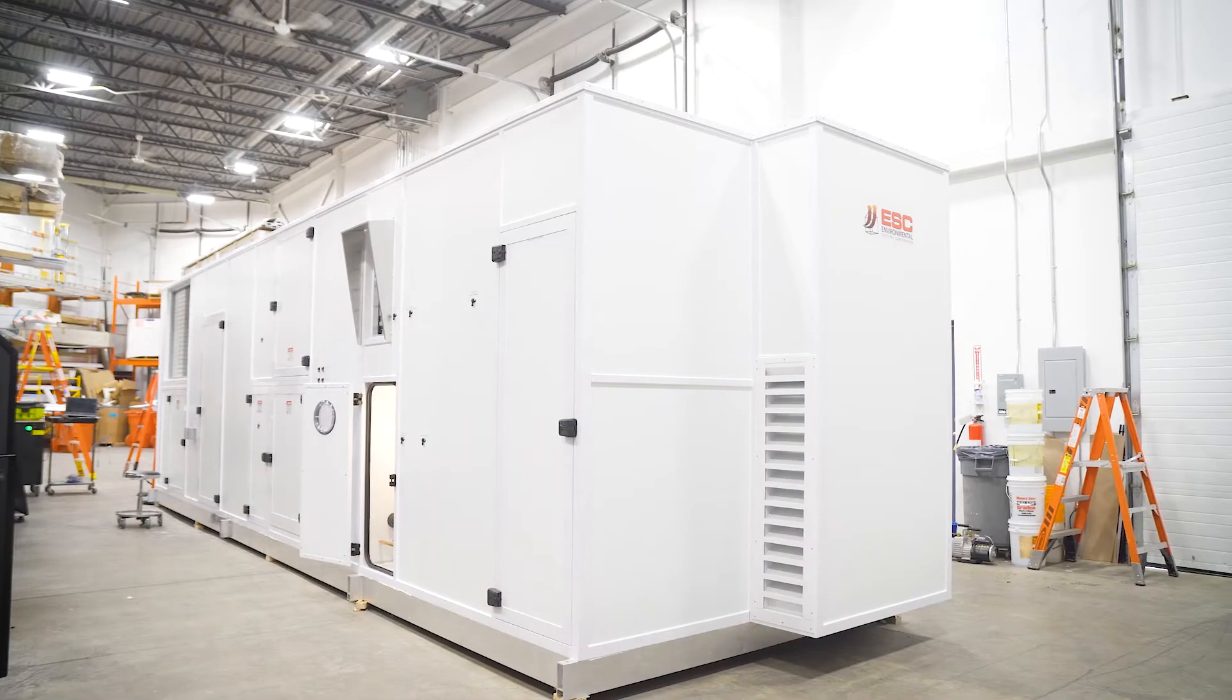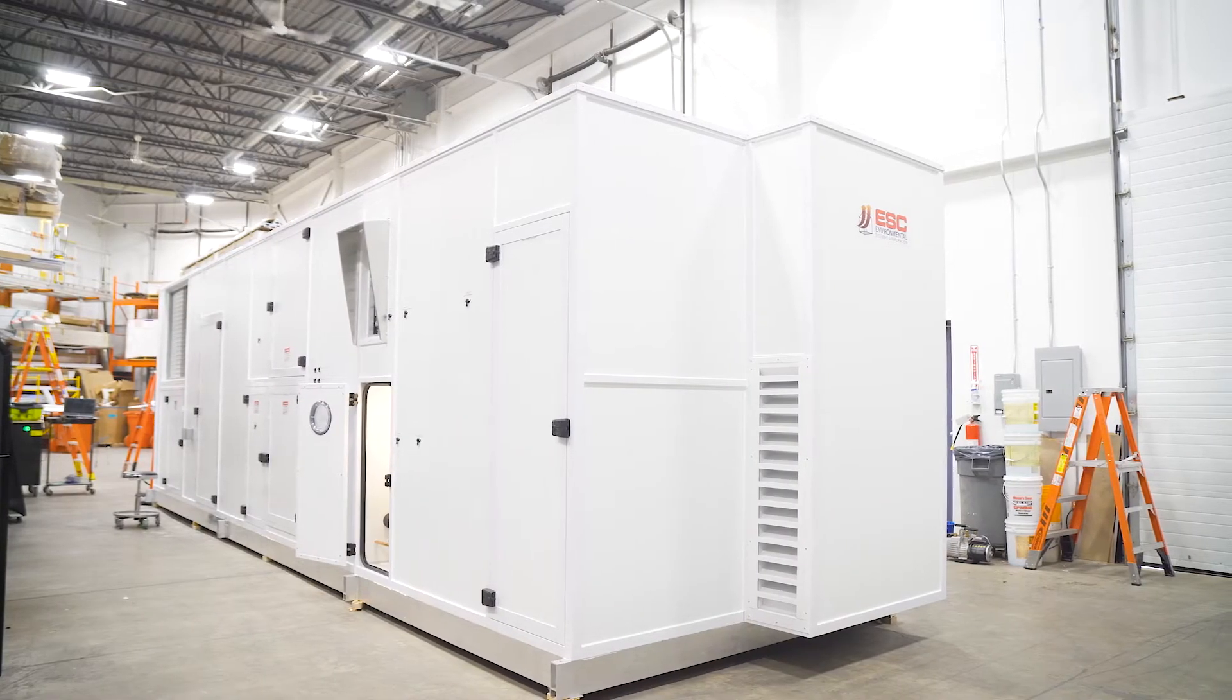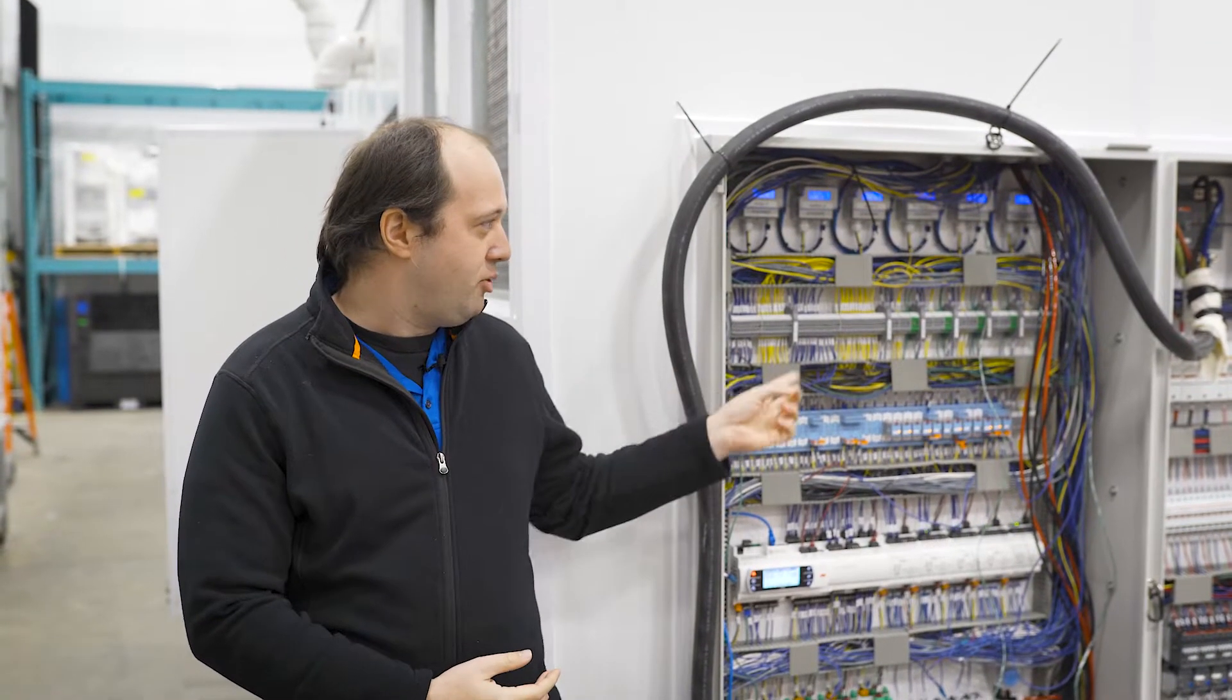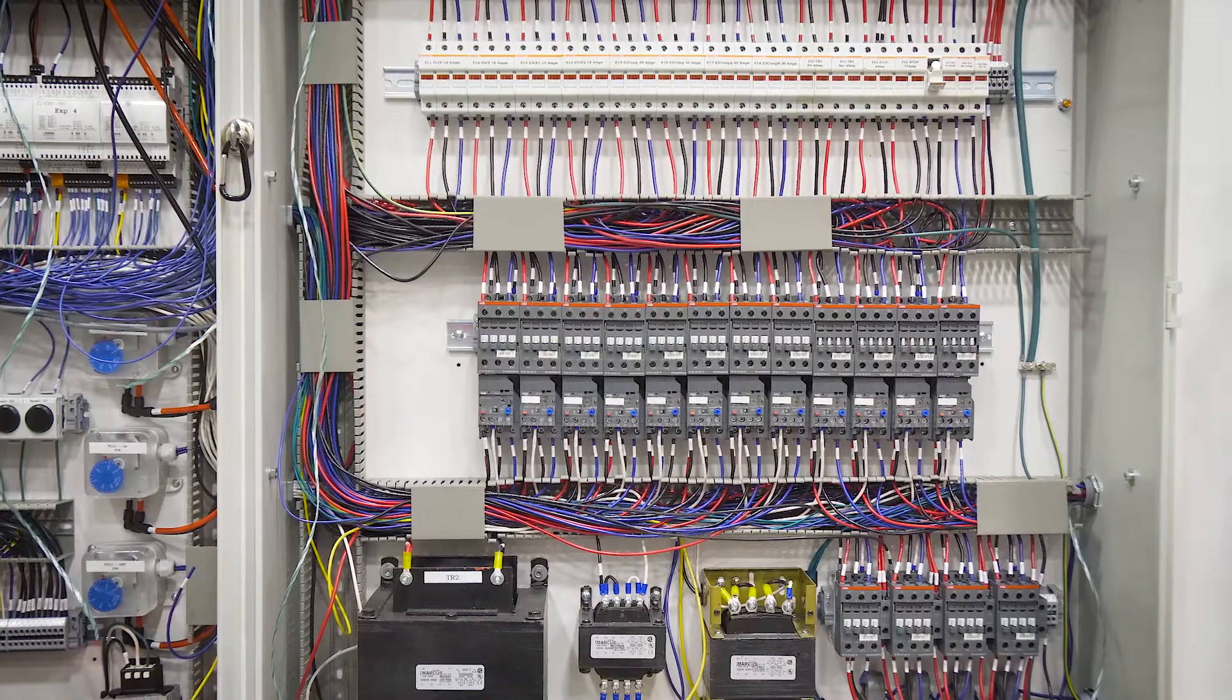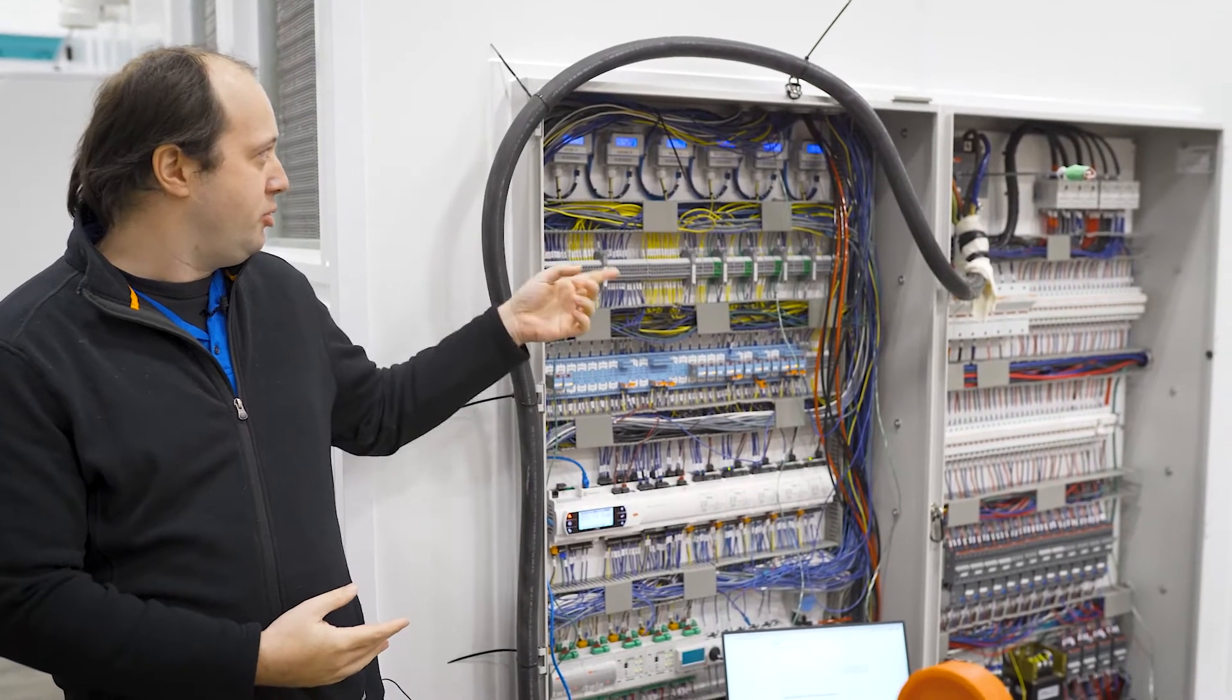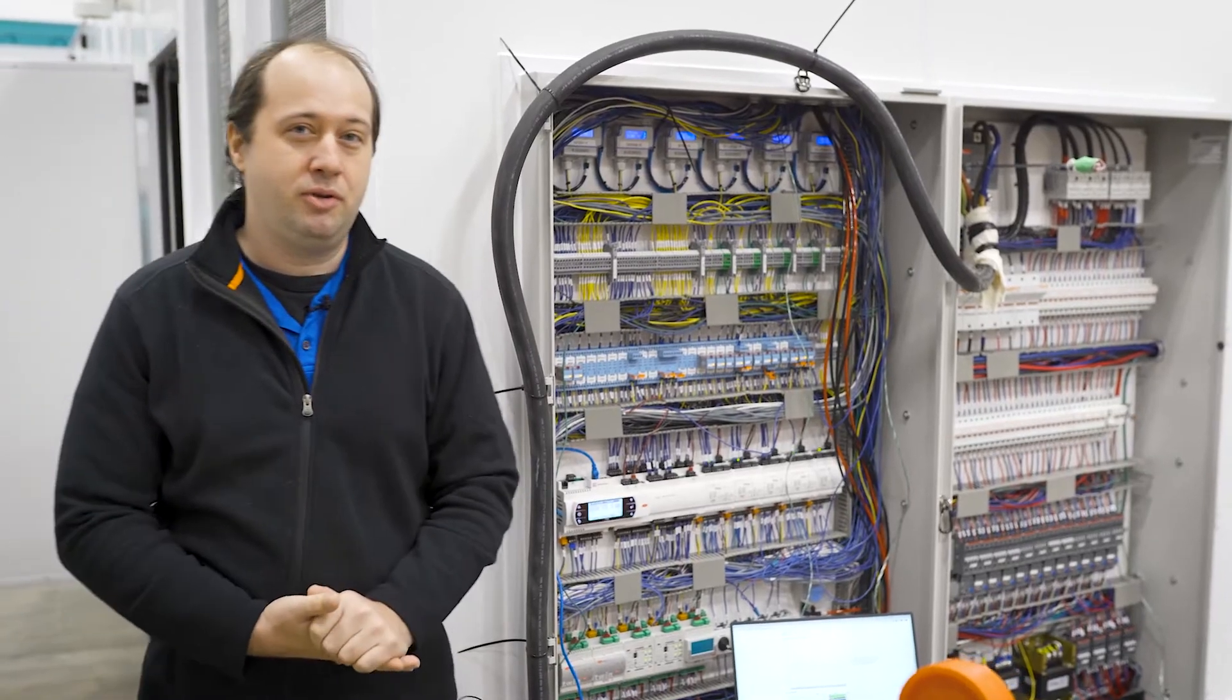This is a custom air handler to serve one of our clean rooms. On this end you can see our low and high voltage electrical panels. This is for interconnecting wiring and some tubing that's spread throughout the unit.